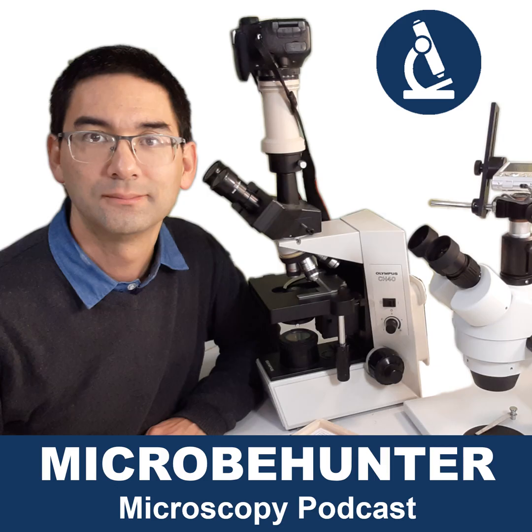So for example, viruses cannot be seen using light microscopes simply because they're way too small. Generally, as a rule of thumb, the total magnification of a microscope cannot be higher than around 1,000 times. Any magnification that's more than 1,000 times in a light microscope is something that we call empty magnification, which means that you're going to see it bigger, but it's also going to be significantly more blurry and fuzzy, and you're not going to see more.